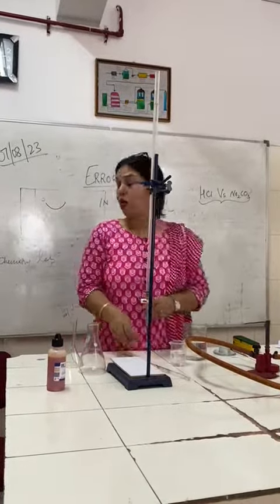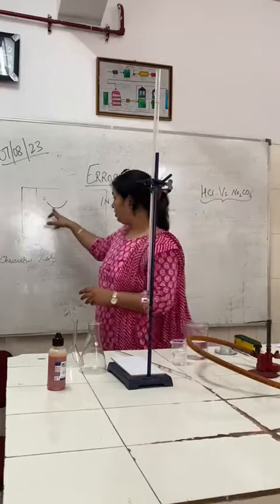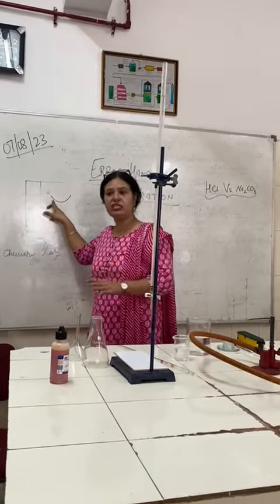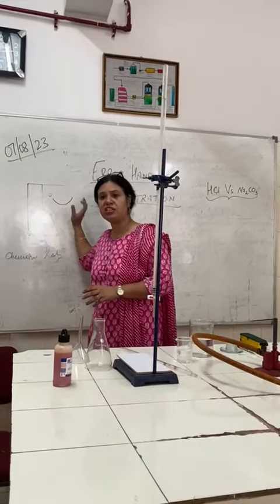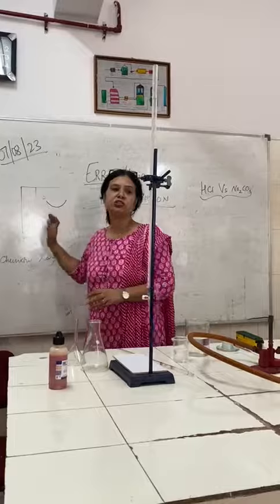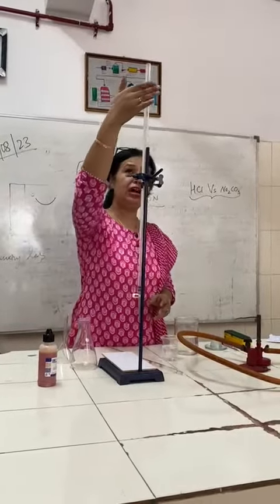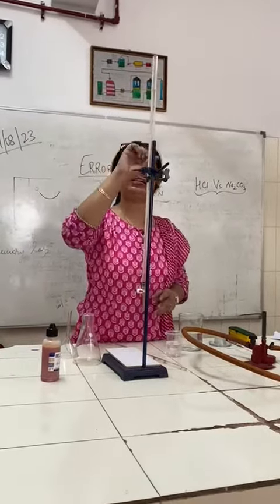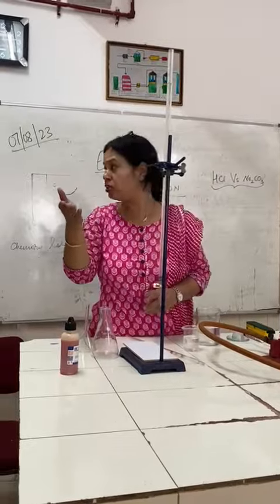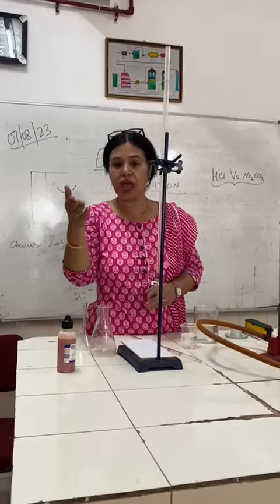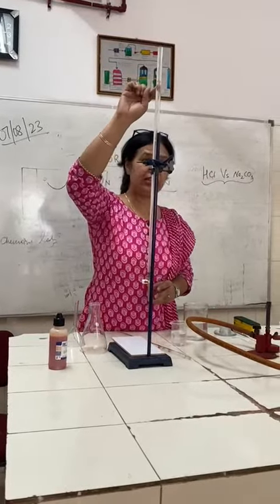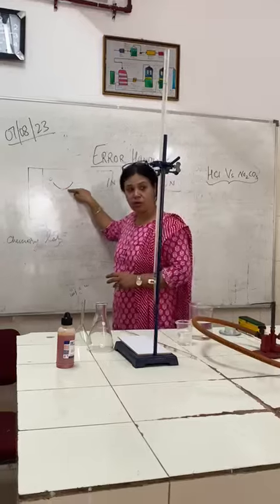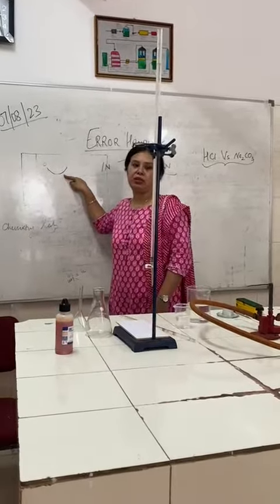The last point is that liquid always has a curved surface, called the meniscus. In case of a coloured liquid we read the upper meniscus because the lower one is not visible. In case of a colourless liquid we always read the lower meniscus because it is visible.